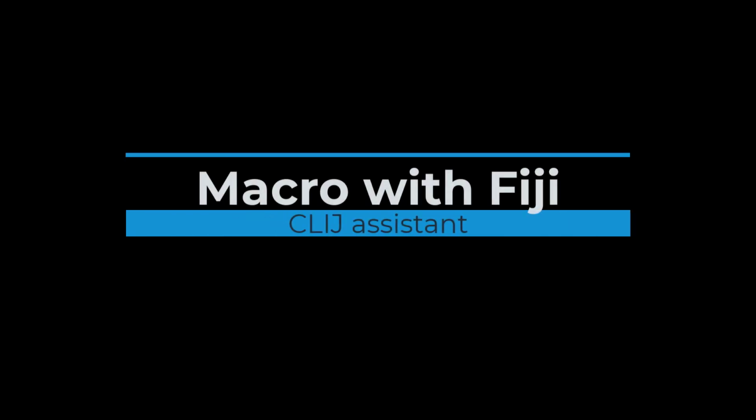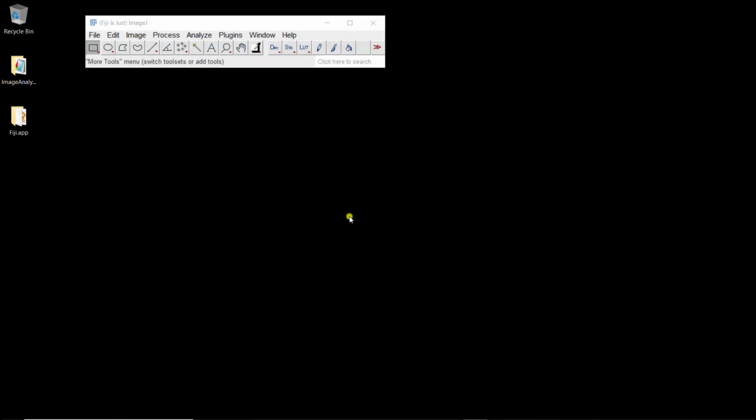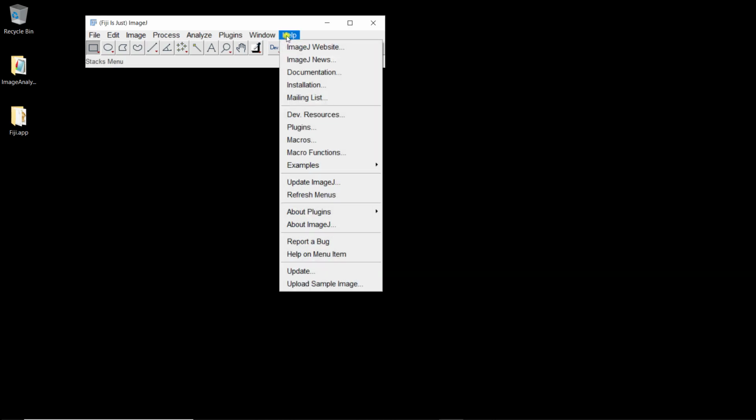In this video, I'm going to show you how you can use CLIJ Assistant to build a workflow with a graphic interface. Alright, so this is Fiji. I haven't installed anything about CLIJ so far, so I'm going to show you how you can do this, through the usual way to install plugins, meaning you go to Help and then Update.